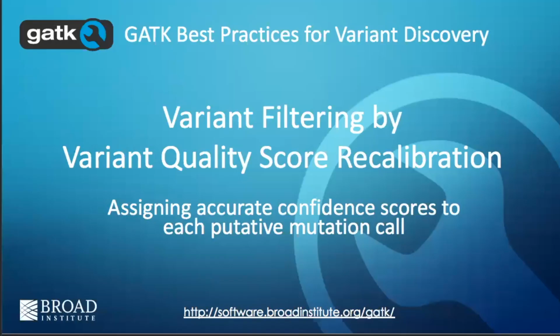So we got calls from HaplotypeCaller, and as I mentioned before, HaplotypeCaller tries to output as many variants as possible, even if they're not the best quality, with the reasoning that we will filter out the things that we don't want later.